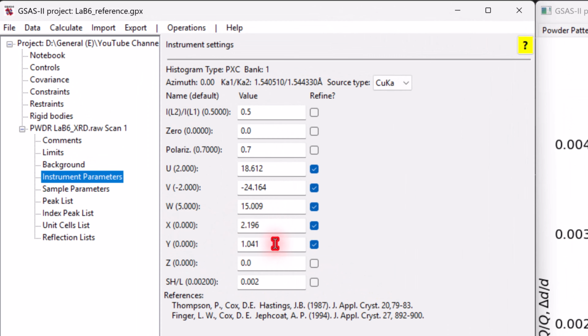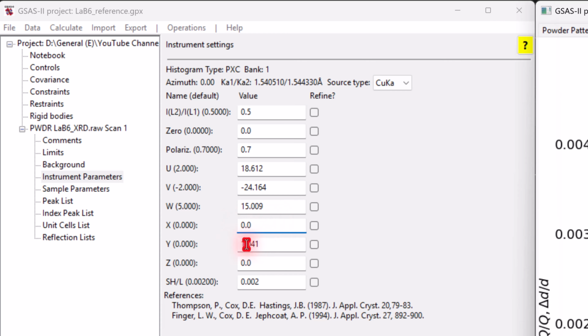However, X and Y must be treated cautiously because they can include broadening associated with the standard itself, such as finite crystallite size or microstrain. Our aim is to create a transferable instrument baseline, not to store the complete physical history of this particular powder mount. Therefore, after recording the diagnostic result, I uncheck X and Y and set both values back to 0 before saving the profile. I do not rerun the global fit after this reset.